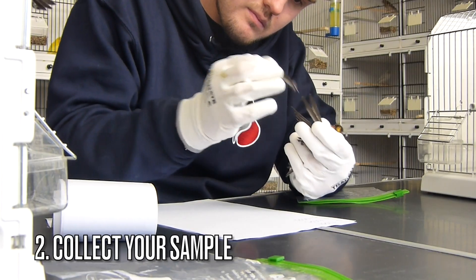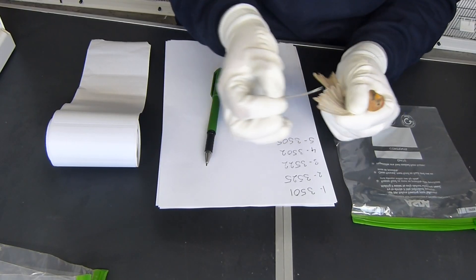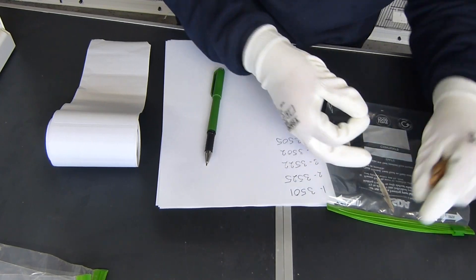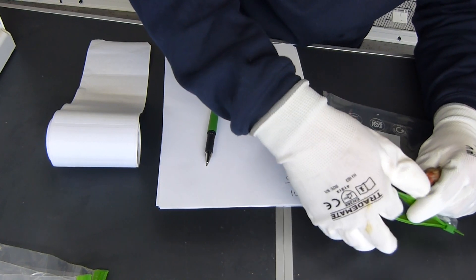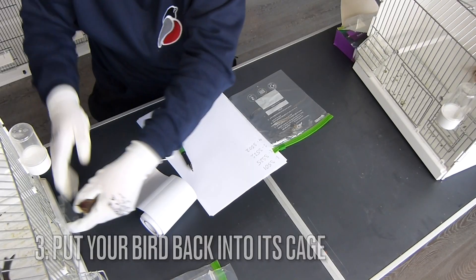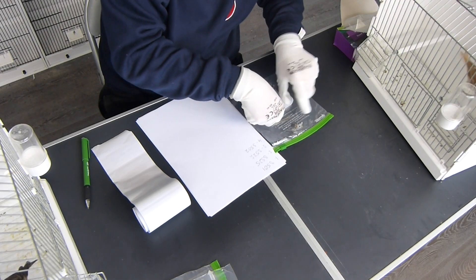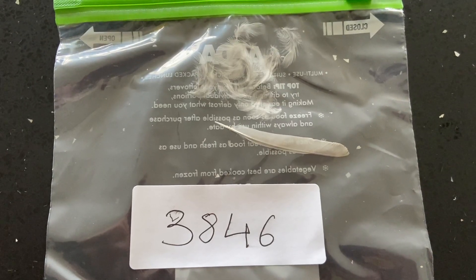Next you're going to collect your sample. Remove a couple of flight feathers or tail feathers, and I also add some breast feathers from each bird. Make sure to be very gentle with this — it shouldn't harm the birds at all, providing you pull one feather at a time and you're very careful. Then add that to the ziplock bag and immediately put the bird back in its cage so it isn't too stressed. Then label your sample using the ring number of the bird you've just taken the feathers from. Make sure to write this clearly so no mistakes can be made at the other end.